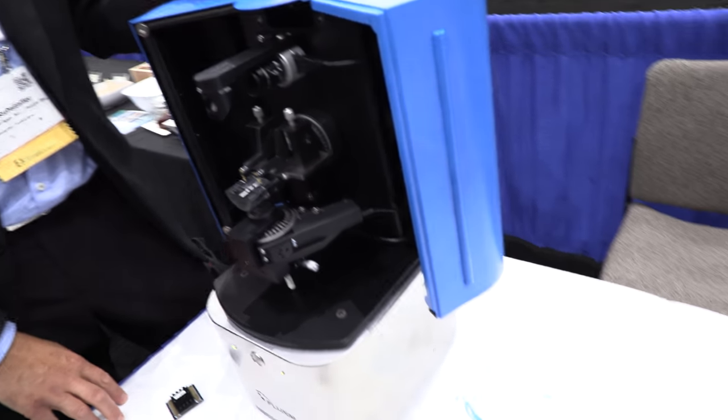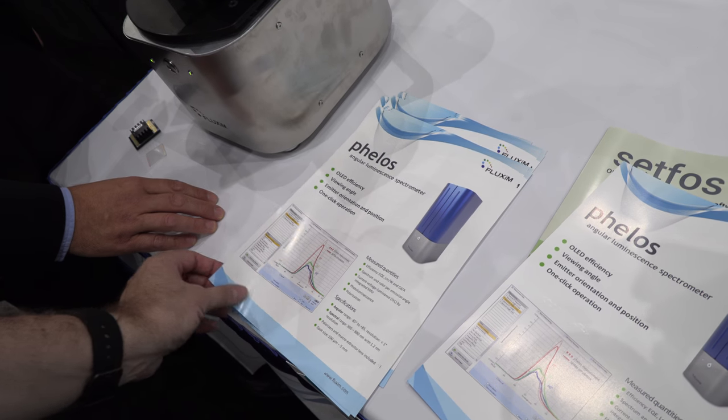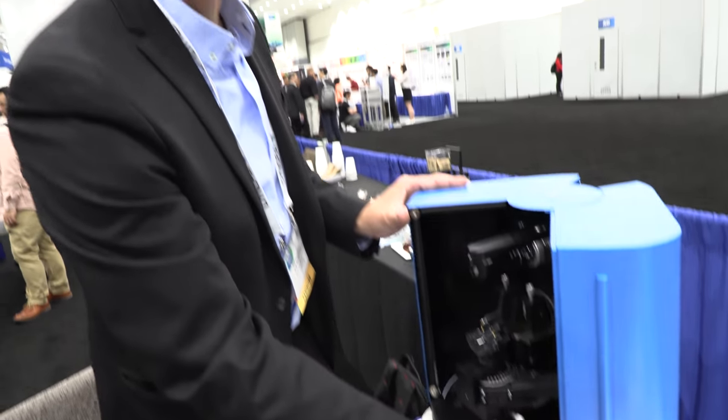So this is the PHELOS? PHELOS. And this is for these kind of companies to buy? Yes. And they put in their labs? Exactly. In their research labs so they can prepare the next generation of OLED displays.